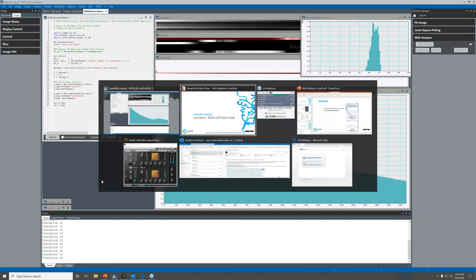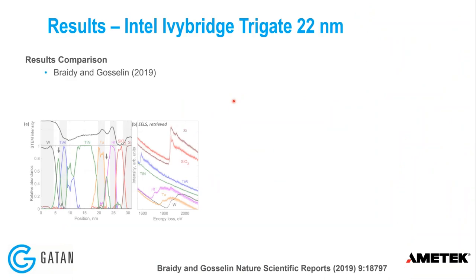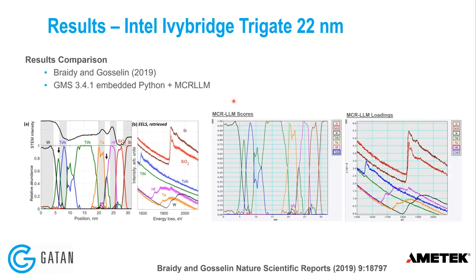Comparing the GMS output with the results in the paper: I've matched the colors and you can see the results are the same. That's pretty nice. I didn't have to leave GMS to do any of this.